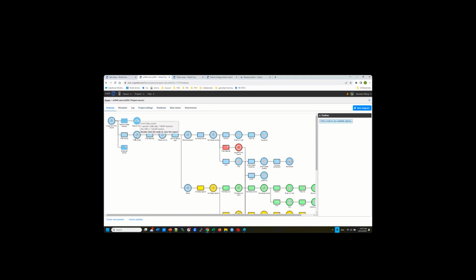Okay? Because later on, you don't want some cells that only have ATAC information but not gene expression information, or vice versa. I want all the cells I keep to have both the gene and the ATAC information.